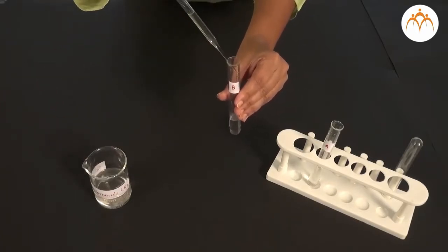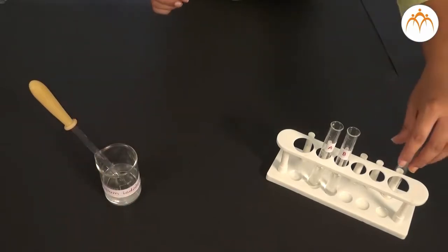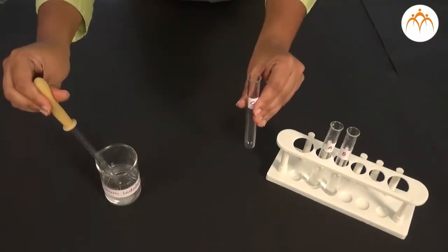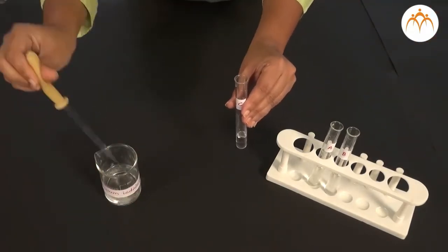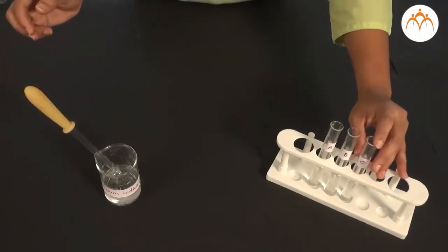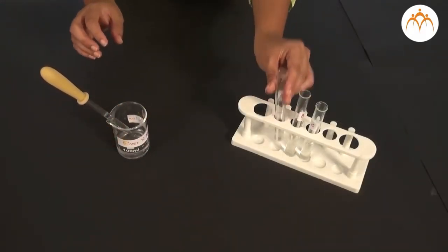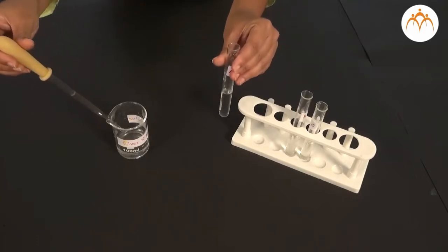Silver nitrate, or AgNO3, is a reagent and it reacts with the solutions in the test tubes A, B and C. Then you will observe what happens. We need to be careful while adding silver nitrate. Don't waste silver nitrate, it is a costly reagent. Adding a very few drops is enough for the chemical reaction. Note down the observations in the table.